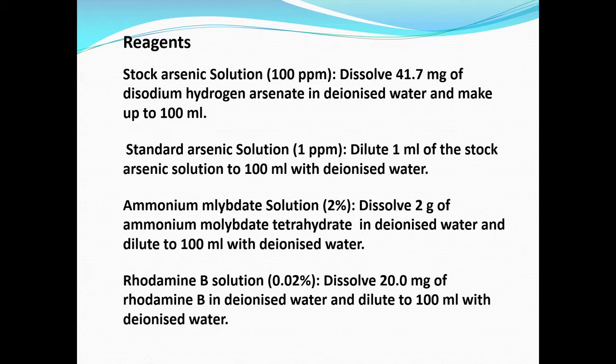It is a cloth dye basically, to make cloths look red and pink etc., but it is also a good analytical reagent, available as a chemical from chemical stores. And of course, when we buy from chemical stores, what we mean is it is available at 99.99% purity. So, that is the idea of using rhodamine B.